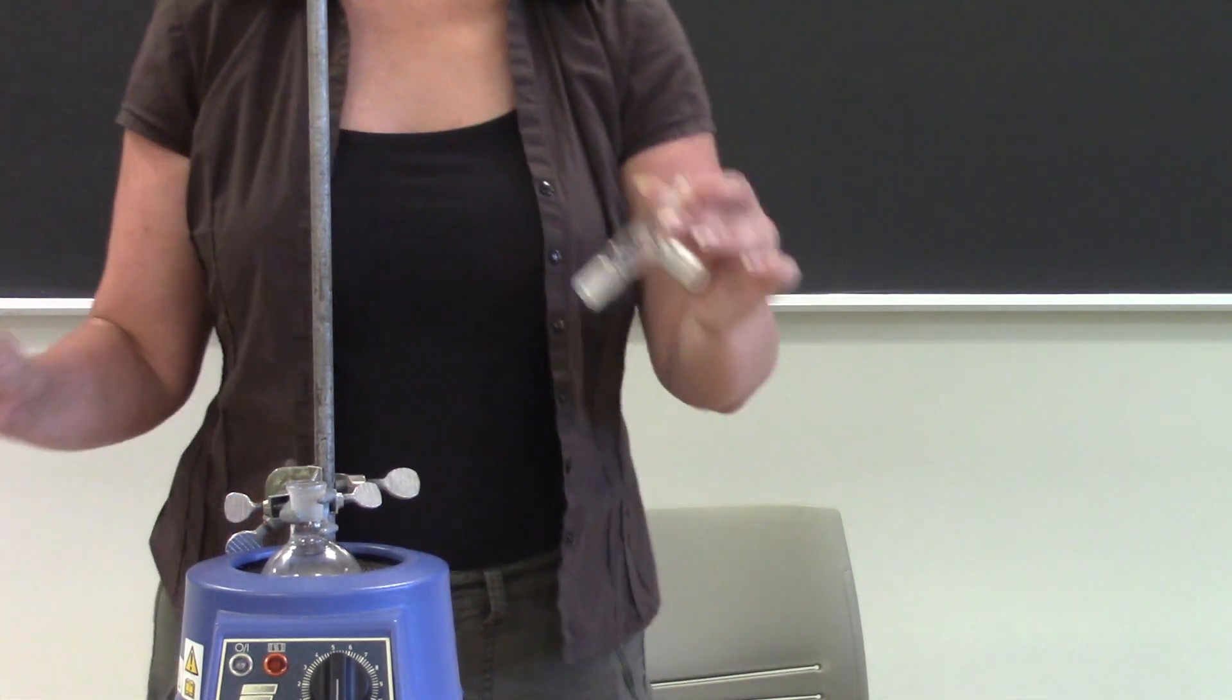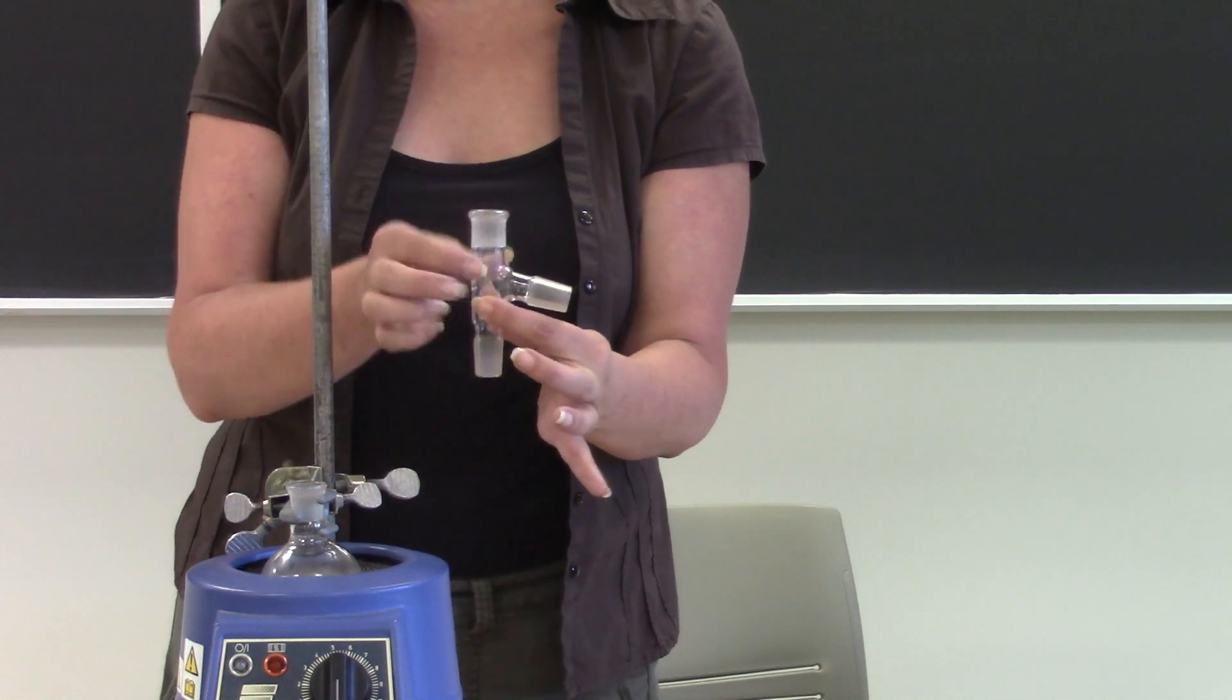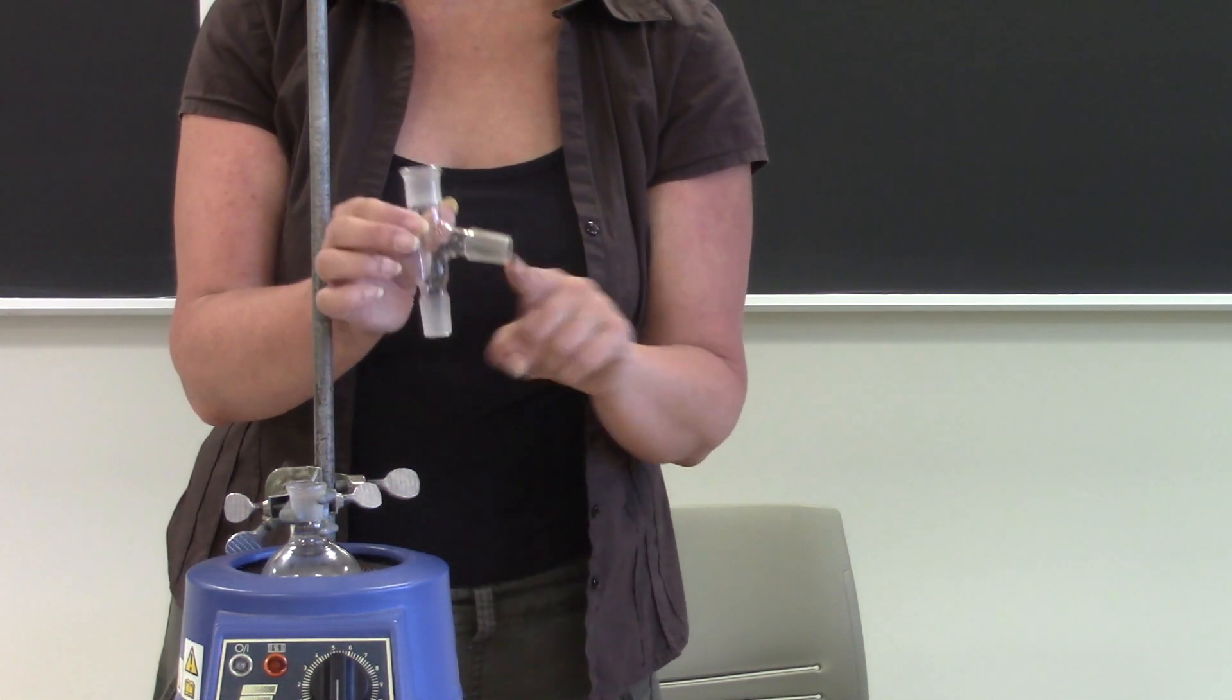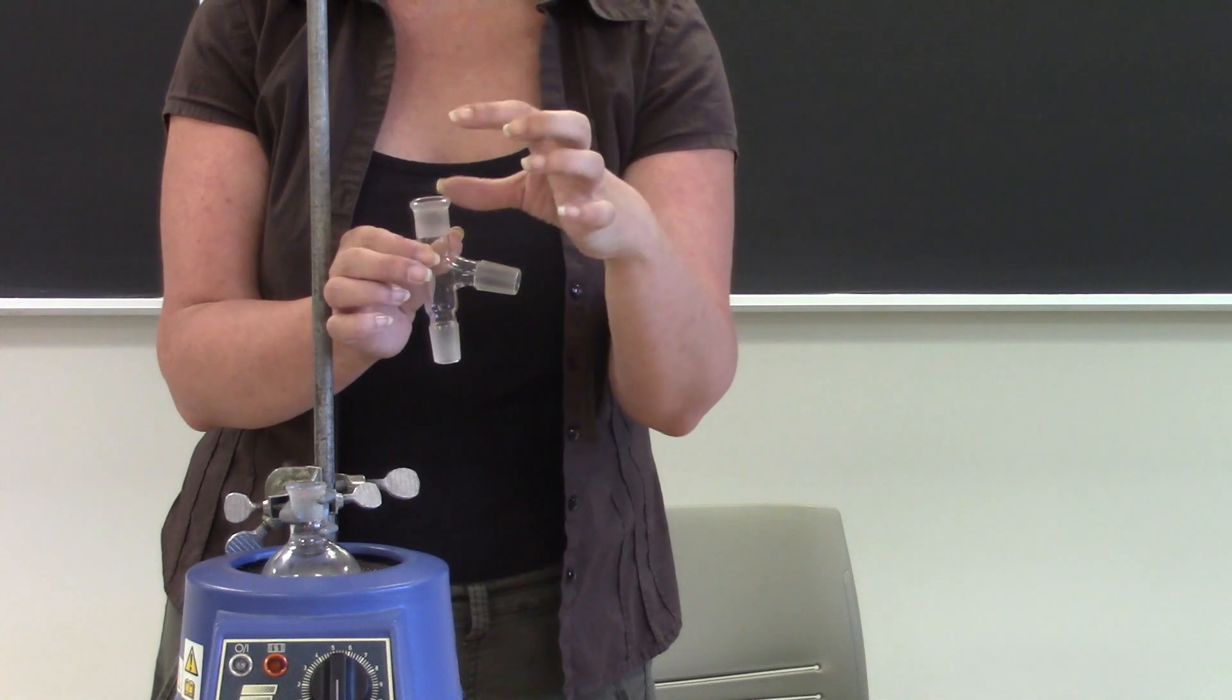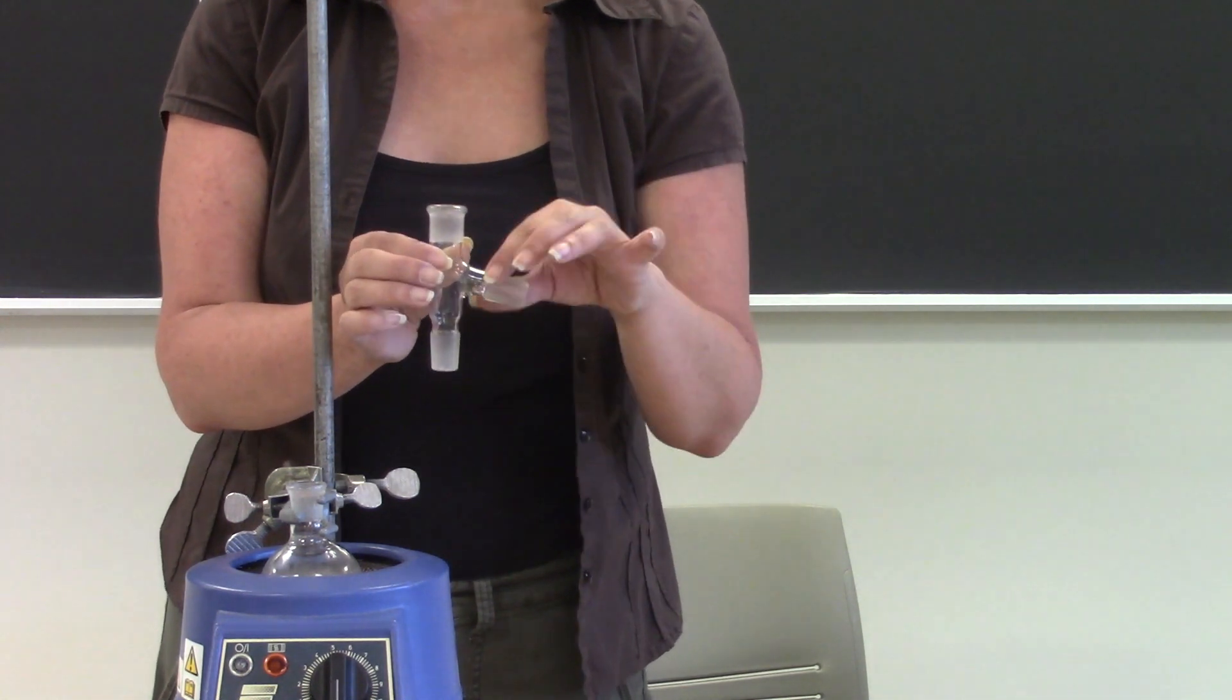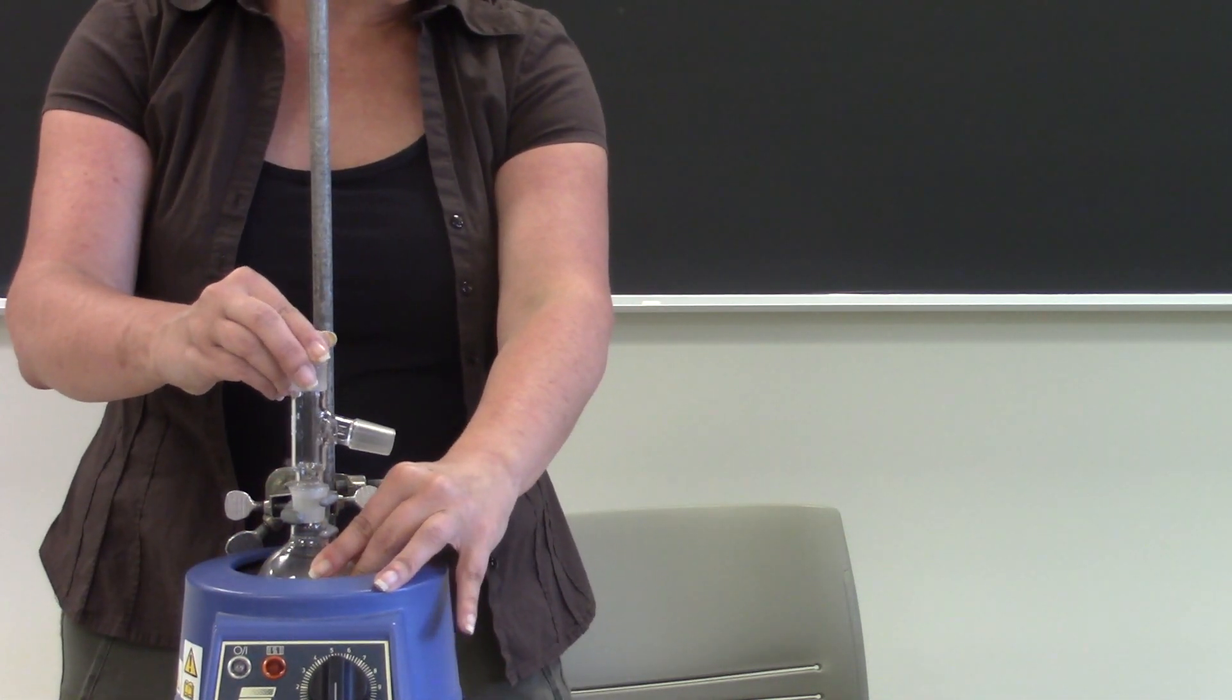Next comes this, it has a lot of different names. Some people call it a distillation adapter, some people call it a three-way adapter or three-piece adapter. That's because it has three different necks. The first neck goes down into the round bottom flask, the one that's pointing up is going to be where you put your thermometer, and the one that's coming out to the side is where you put the condenser. So this is pretty simple, it just drops right in and again I'm going to make sure that that's going nice and straight.